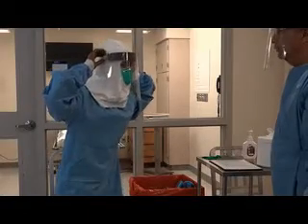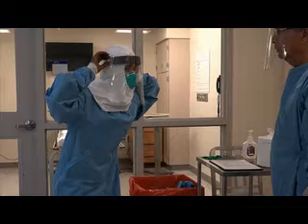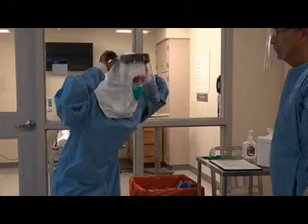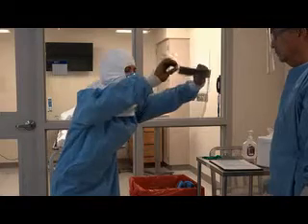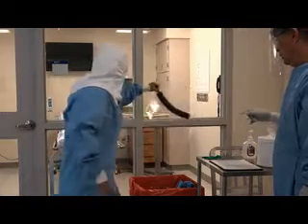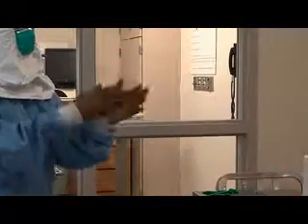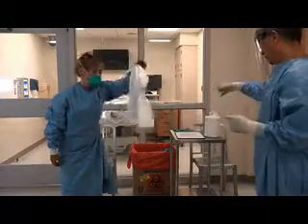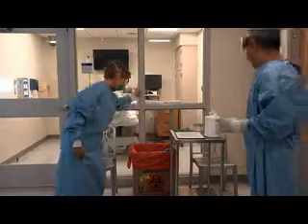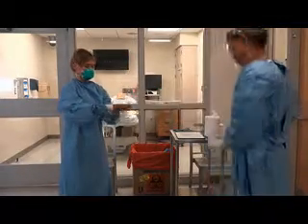Next, remove the face shield. It is particularly important to avoid contamination of the eyes and mucous membranes when removing facial PPE. Tilt your head forward and lift the shield by the strap. Bring it above and away from your head without touching the shield itself and discard it in the biohazardous waste container. Disinfect your gloves. Leaning forward, grasp the hood near the top and carefully pull it off and away from your head. Discard it in the biohazardous waste container and disinfect your gloves.